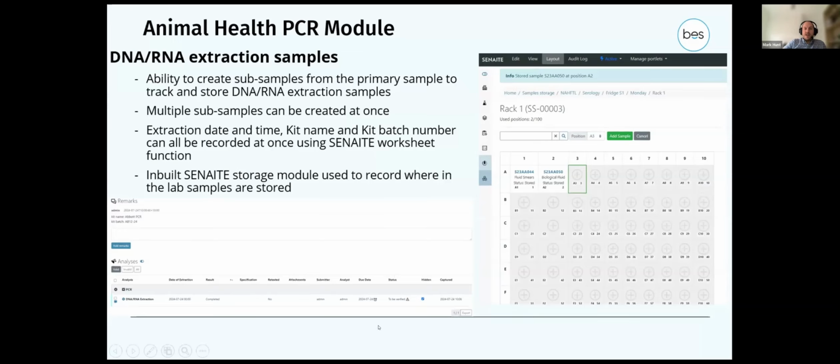So that's it for the PCR module, but I just want to mention as well, Monica will be moving on to the microbiology module, but we also have the microbiology module available for animal health. It's not just for the human health testing.